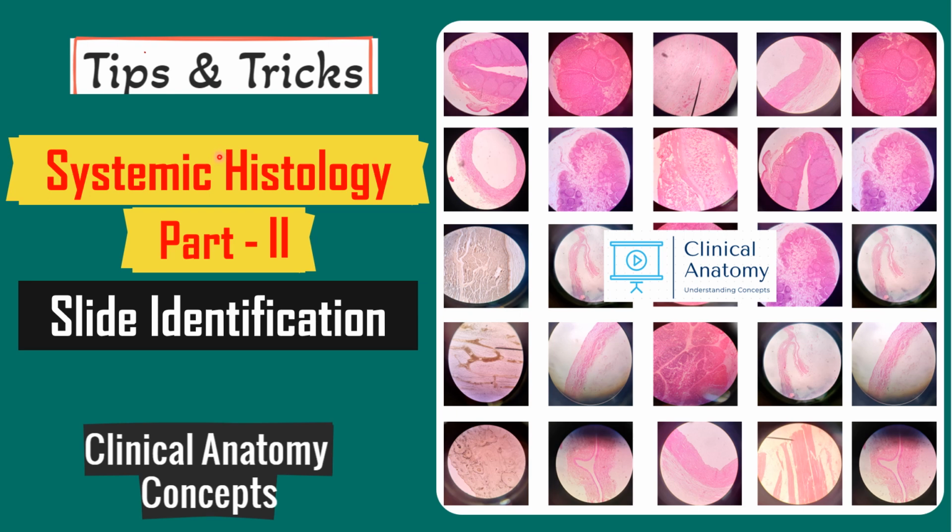Hello everyone. Today we are going to learn about tips and tricks in slide identification of systemic histology. So we are seeing part 2 of the systemic histology.